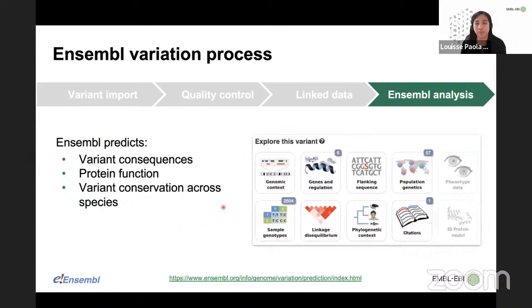Then in the final step of our process, we apply our own analyses on the variation data that we imported and that passed our quality control. Here we predict the variant consequence, we predict the protein function, we calculate linkage disequilibrium and variant conservation across different species.